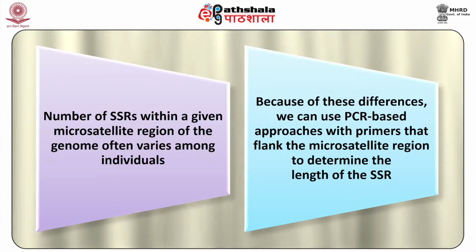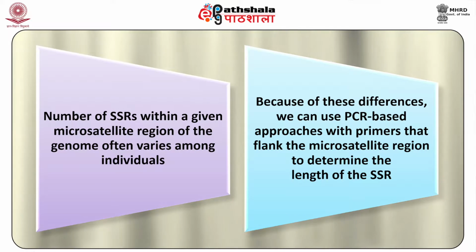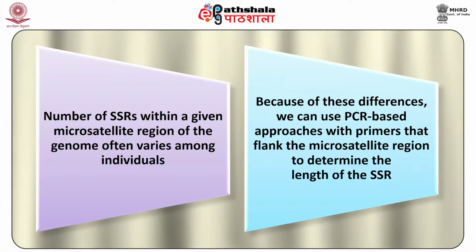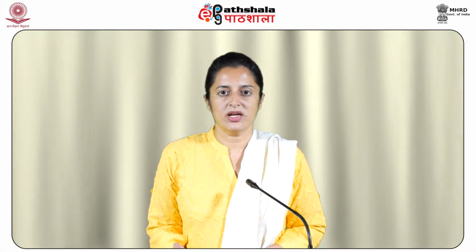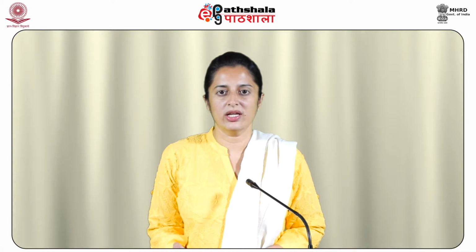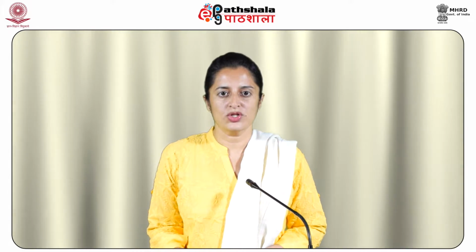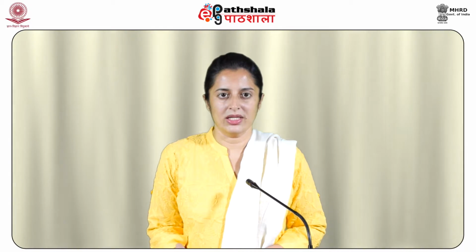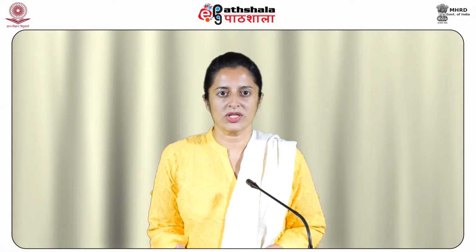Because of these differences, we can use PCR-based approaches with primers that flank the microsatellite region to determine the length of the SSR. The size of the resulting PCR products is determined using high-resolution gel electrophoresis. This approach requires knowledge of the genome sequence to design the primers, but it can be used to detect multiple alleles for a given microsatellite region.